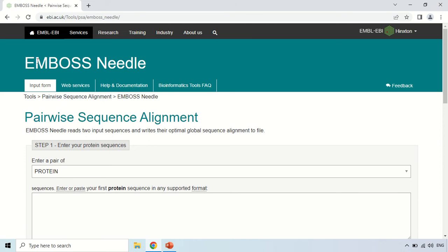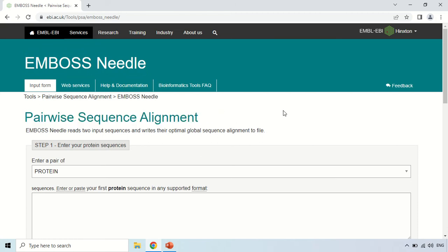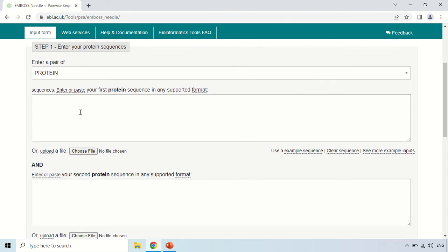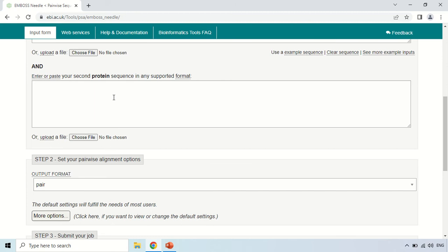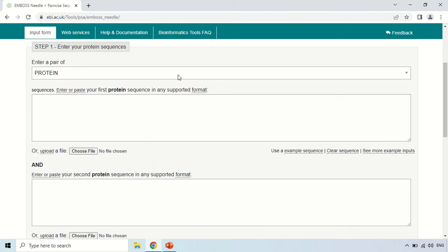Here you can see the EMBOSS Needle tool, which performs pairwise sequence alignment. There are two boxes in which you have to paste your sequences. In the first box you paste your first sequence, and in the second box you paste your second sequence. You also have the option of choosing a file instead of copy and pasting — you can choose the file of your first sequence and the file of your second sequence.